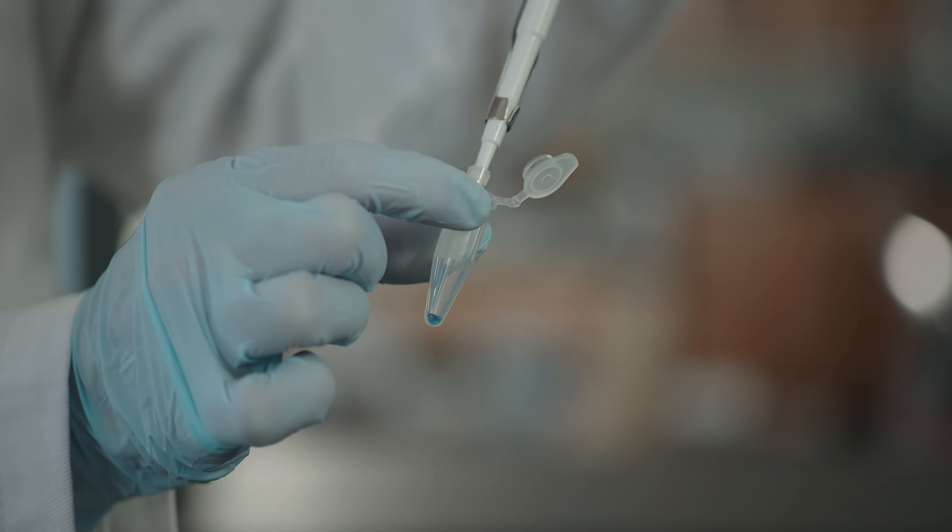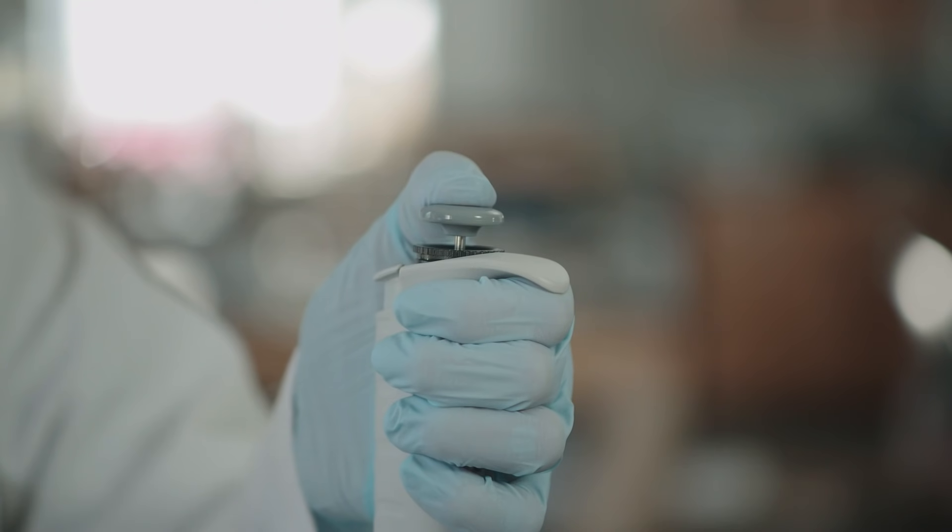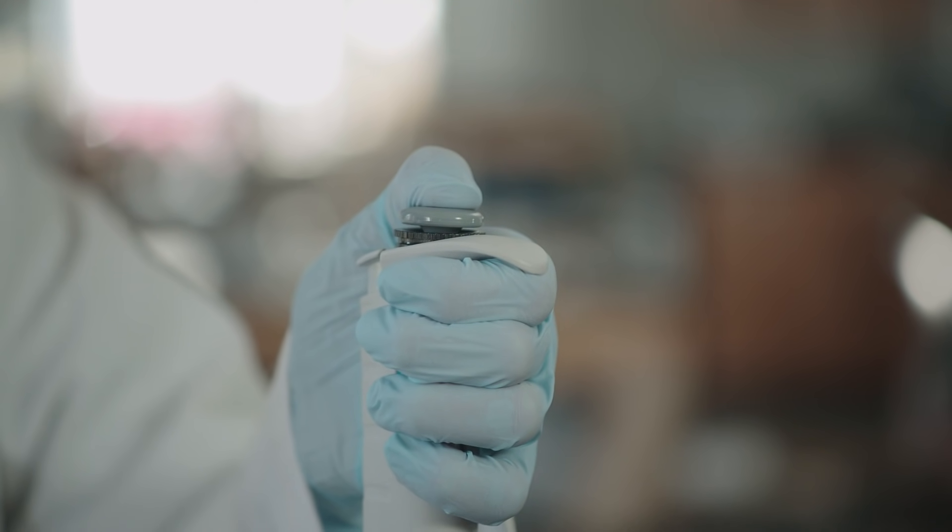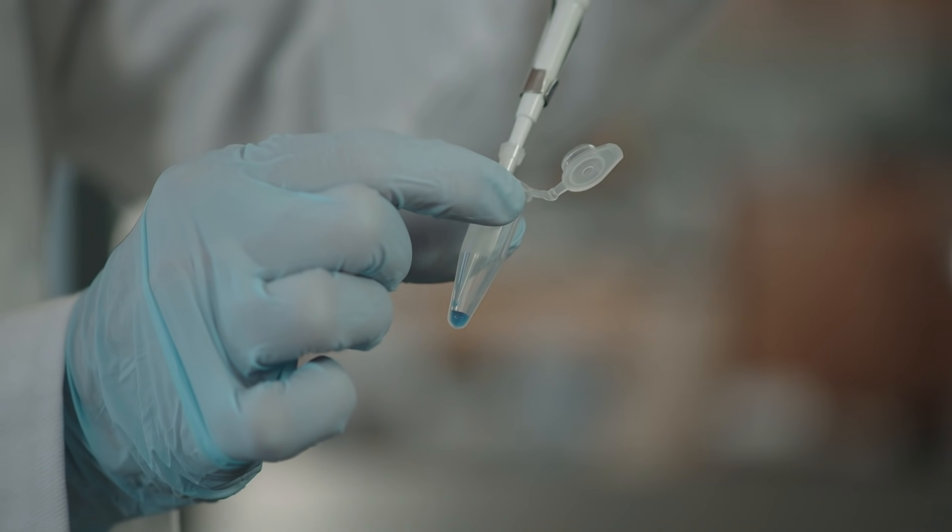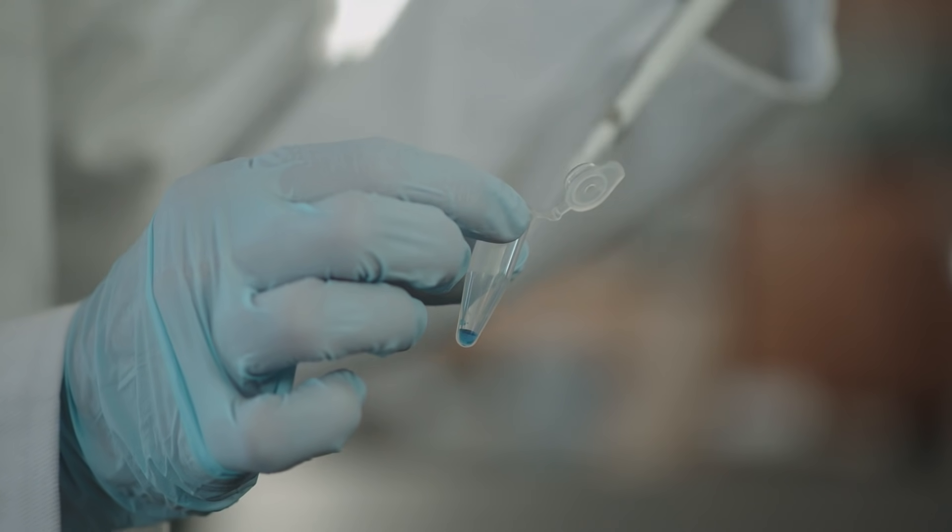Remember that the plunger has two stops and that you pushed to the first stop when you were taking fluid up into the pipette tip. To remove the last bit of fluid from the pipette tip, push past this first stop to the second stop. This will expel any liquid remaining in the pipette tip. Hold down the button until the tip is no longer touching the fluid. Otherwise, you may aspirate the fluid back up into the tip.